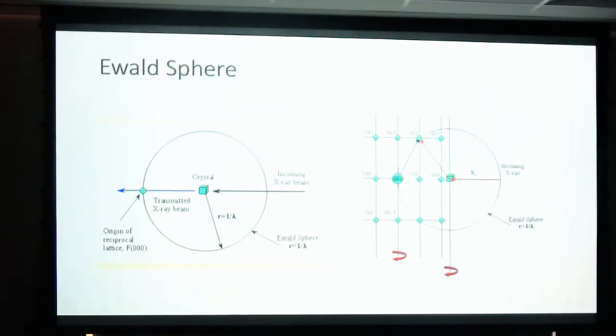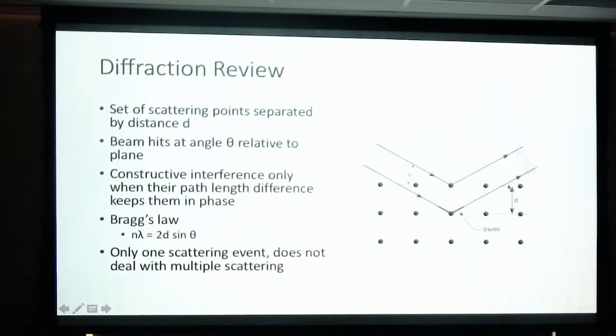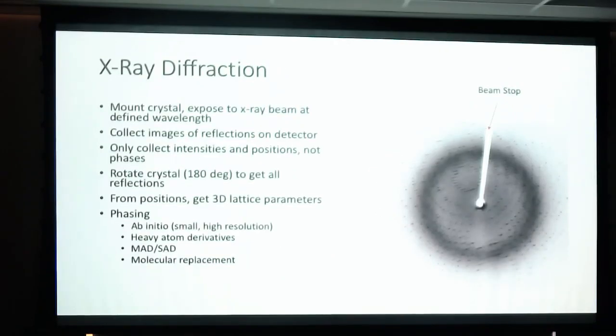Another thing is, if you look at the diffraction pattern, I naturally think that since it's some sort of regular, squarish lattice, you would expect a regular squarish pattern. But when you look at the diffraction pattern that's collected, you can see it's following all of these curves. It's not really straight lines. There are straight lines in it from the lattice, but you see these curves of density being collected instead of straight lines.